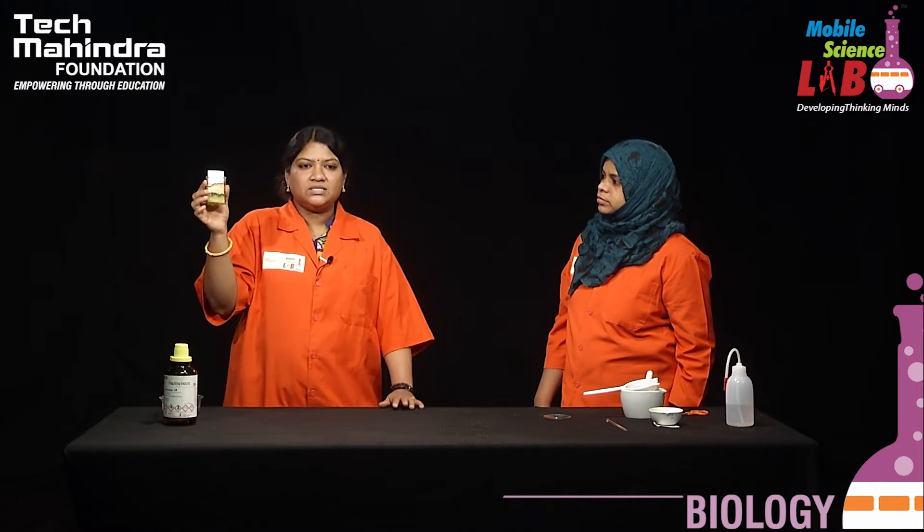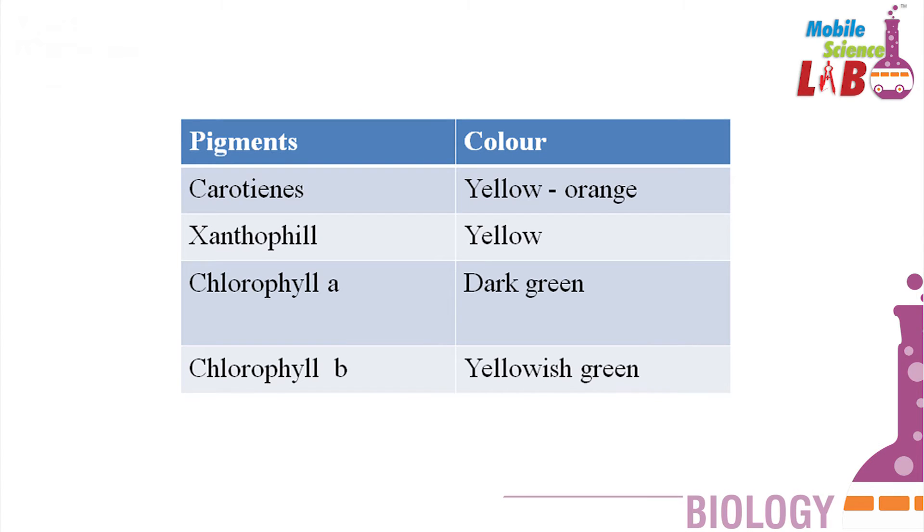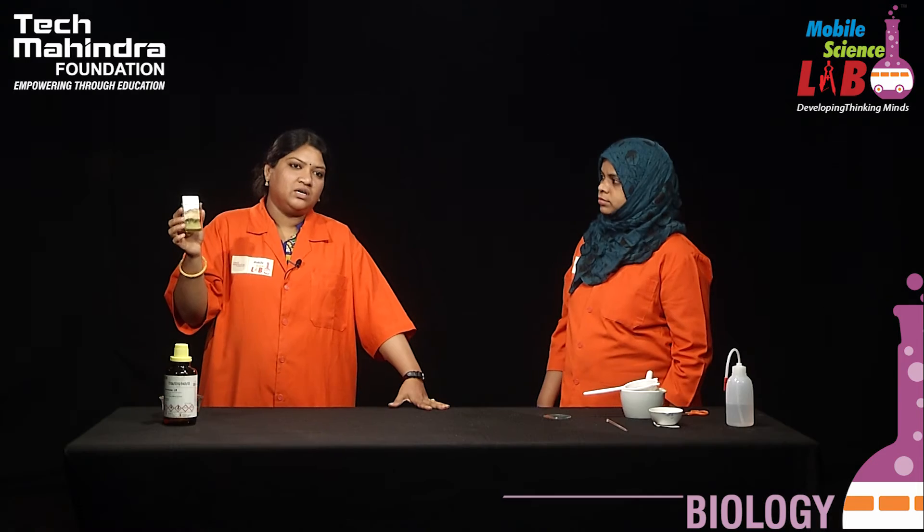Can you clearly see any color difference? We can see two colors that have been separated by paper chromatography — one is the green color from the plant pigments and the orange color from the flowers we used. Similarly, we can even get red color based on the pigment that we are using. This is a very specific and very useful process.